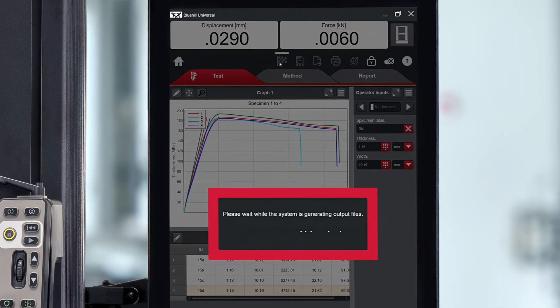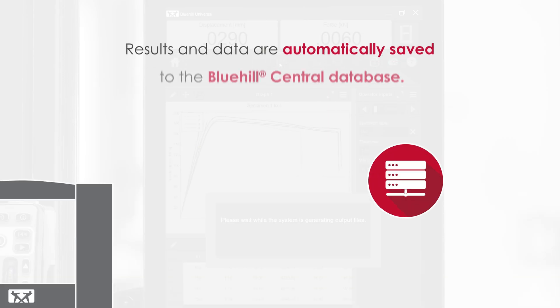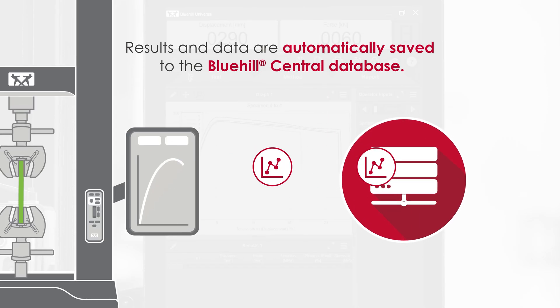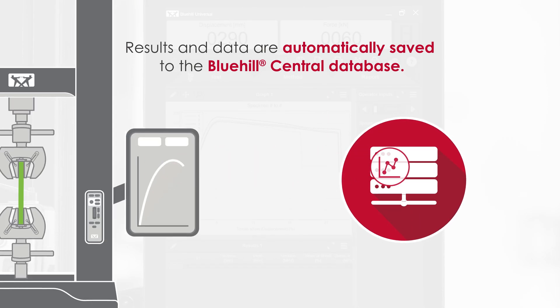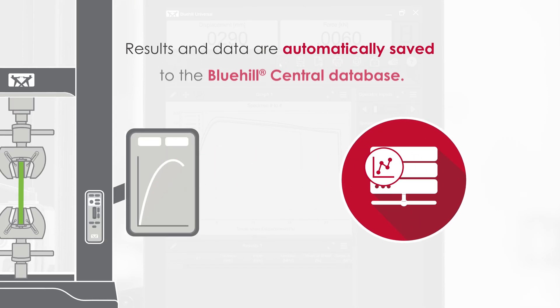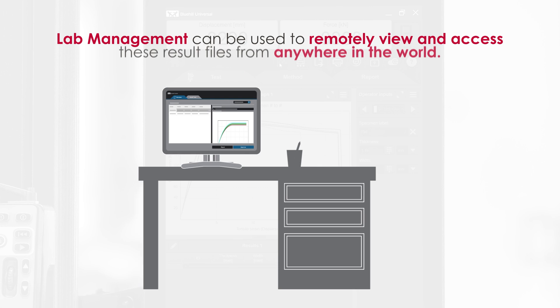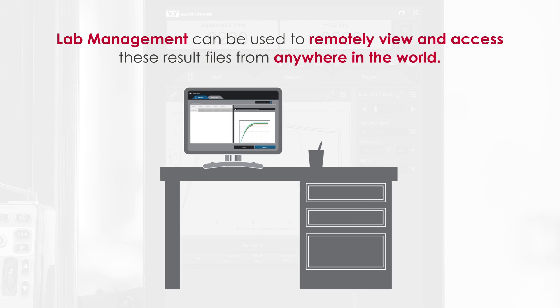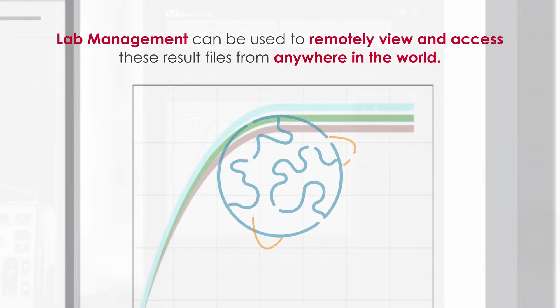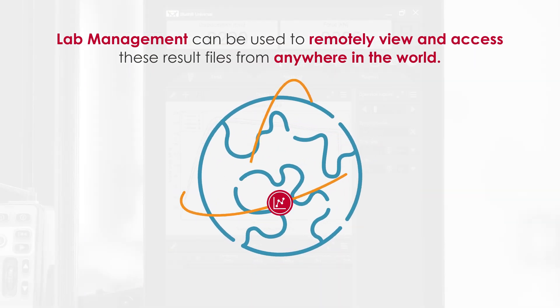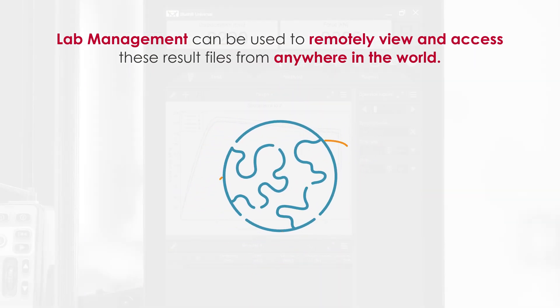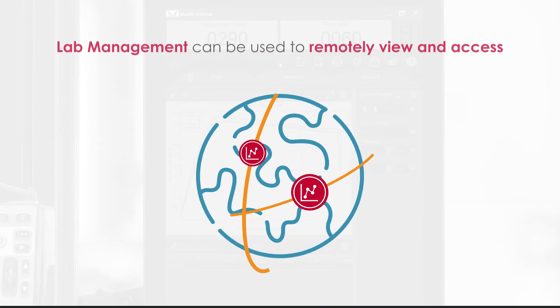Once testing is complete, results and data are automatically saved to the Bluehill Central database. Lab management can be used to remotely view and access these result files from anywhere in the world.